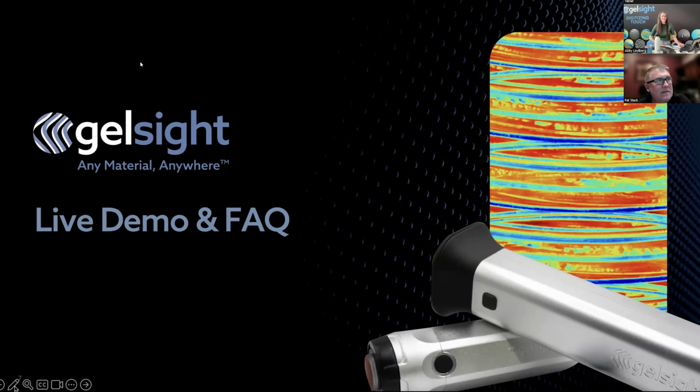Can the output data be transferred in a point cloud or CAD format? Sure, so we can export the STL file of any of the scans that we just took. We do also output a TMD file, which is our raw 3D data. A couple different software programs can open that, and we do have a repository on GitHub that'll help you write your own program to read that data too.